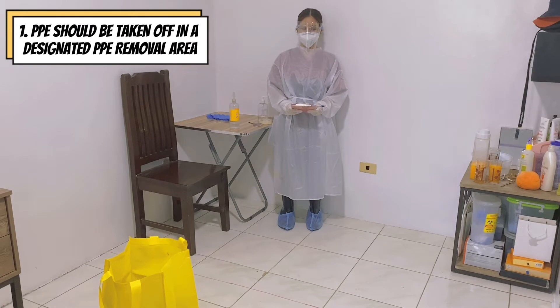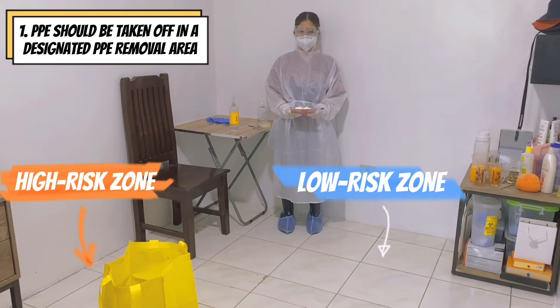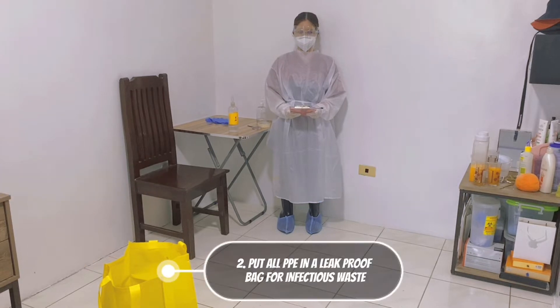PPE should be taken off in a designated PPE removal area wherein there is a high-risk zone and low-risk zone. Put all PPE in a leak-proof bag for infectious waste.